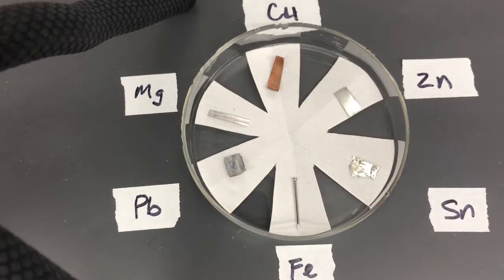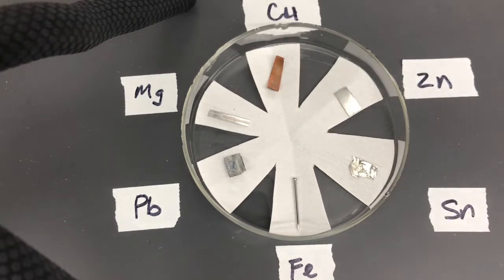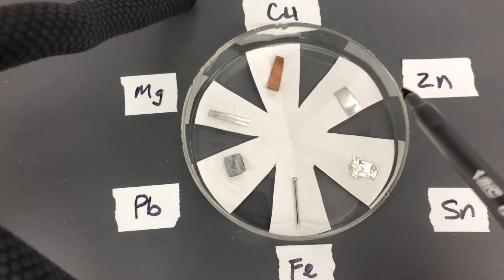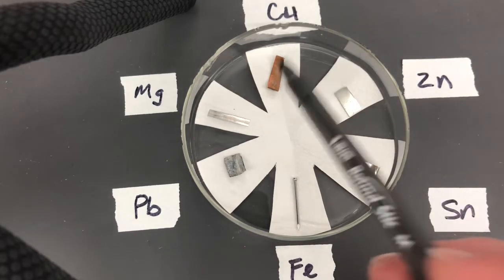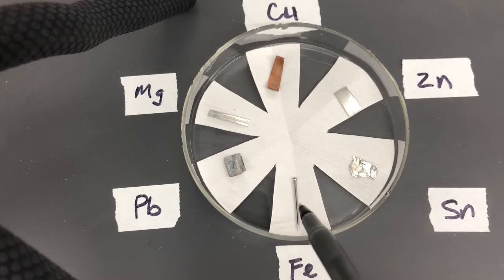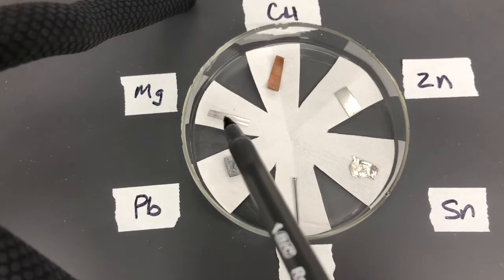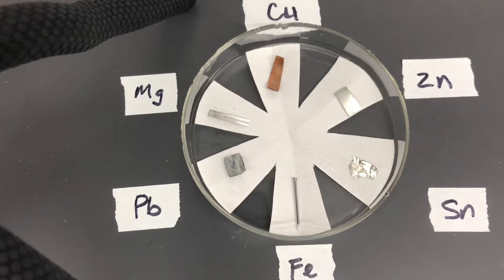So what I've done here is I've taken a piece of filter paper and I folded it into 6. I've cut out a chunk of the filter paper and placed the filter paper in a petri dish. In that petri dish, with each one of the half cells I'm interested in, I've placed copper metal, zinc metal, tin foil, an iron nail that's not galvanized, some lead metal, and a strip of magnesium.